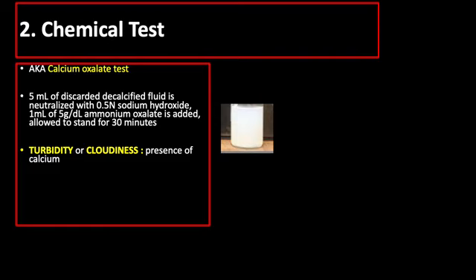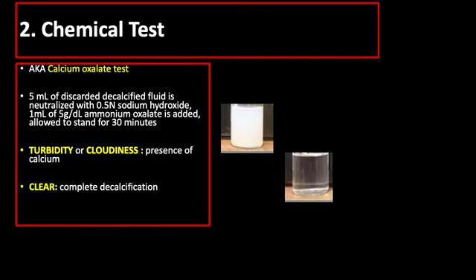So appearance of turbidity or cloudiness indicates the presence of calcium. And if the solution remains clear after 30 minutes, it means that the decalcification process is already complete.